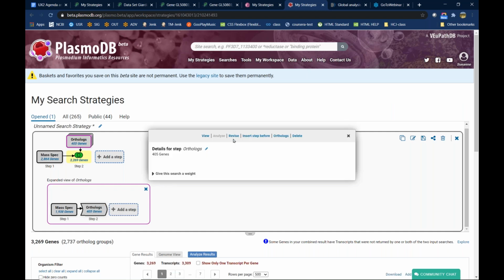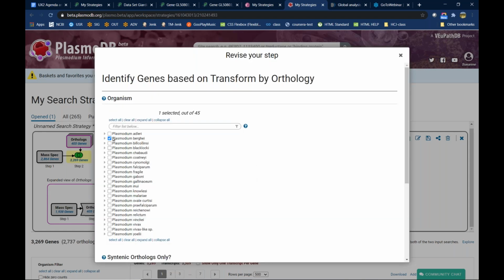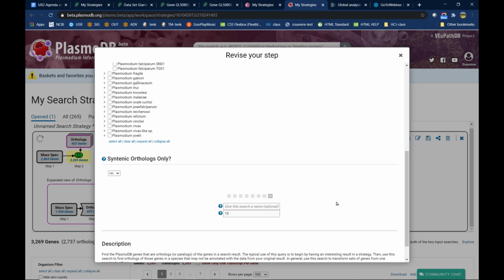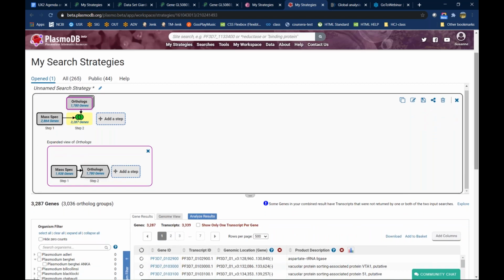I think as you're doing that, one cool thing, this orthology step, allows you to really leverage experiments from across species, as Suzanne was indicating. She's doing a union here because she's saying, I want to cast the widest net. I want to find the largest number of potential gametocyte genes that are expressed from proteomics experiments. But you could imagine also changing that to an intersect, if you want to simply say, well, if it's in gametocytes in falciparum, and also in gametocytes in falciparum orthologs of Berghei ones, then I'm interested in those. Those will give me higher confidence, for example.